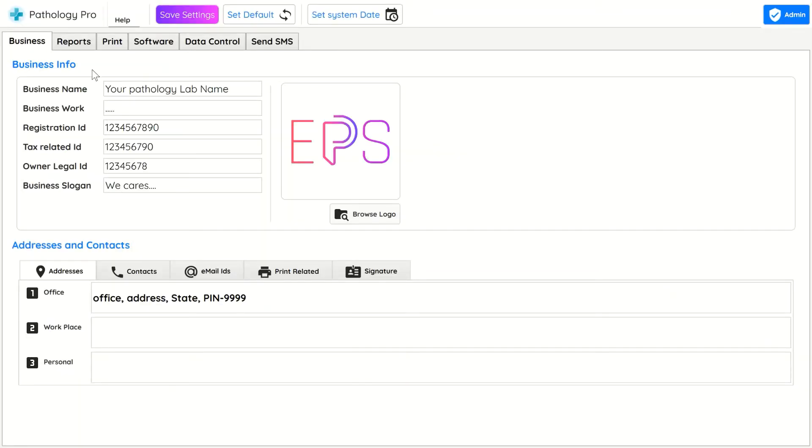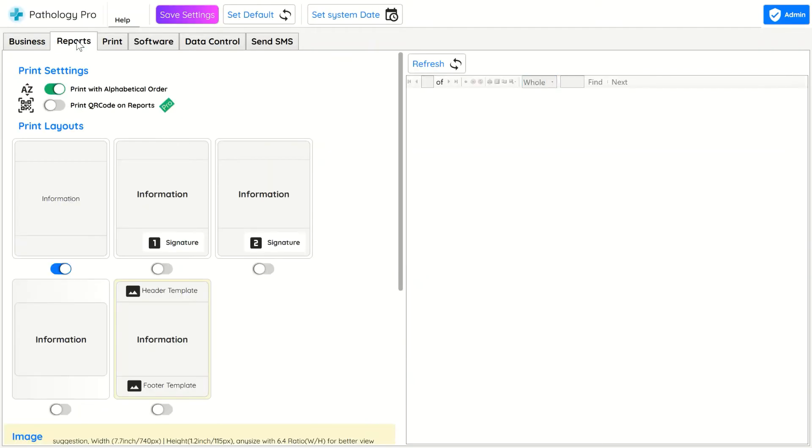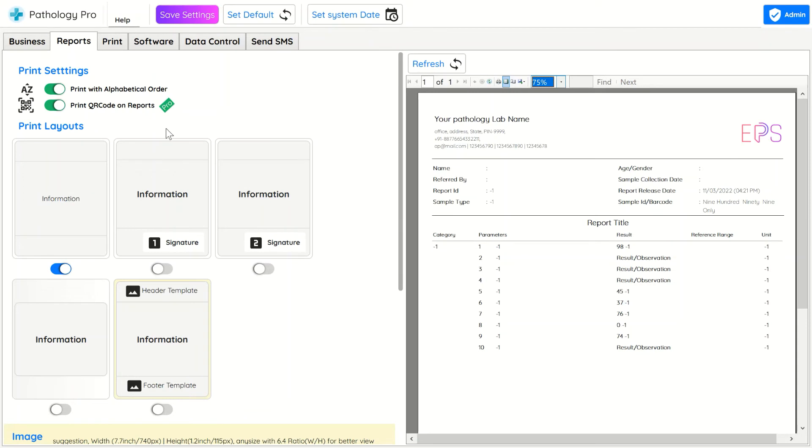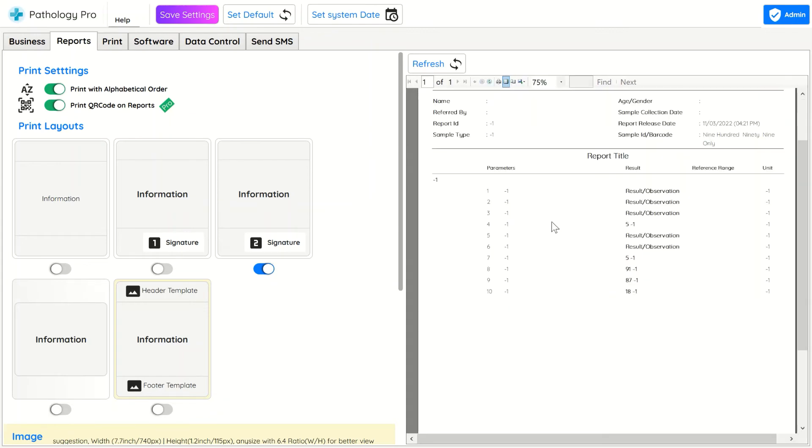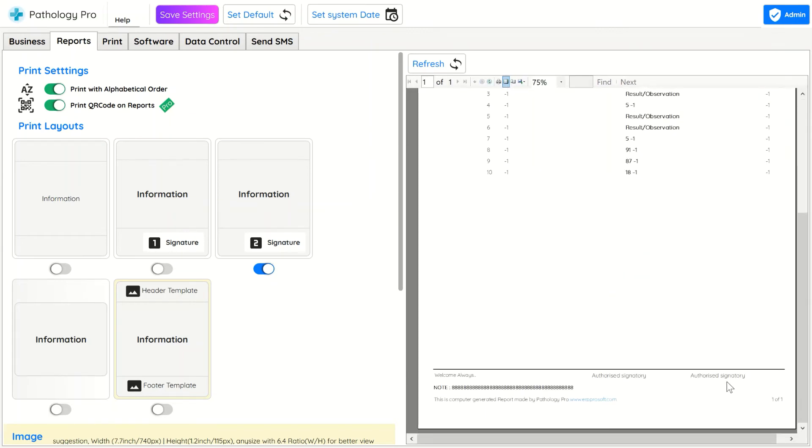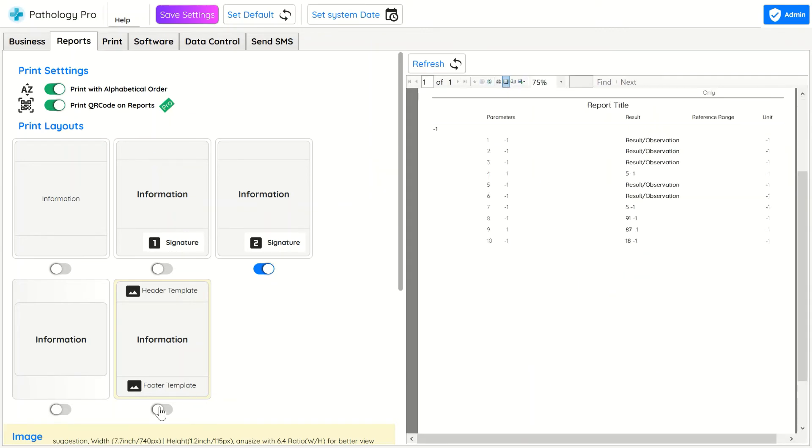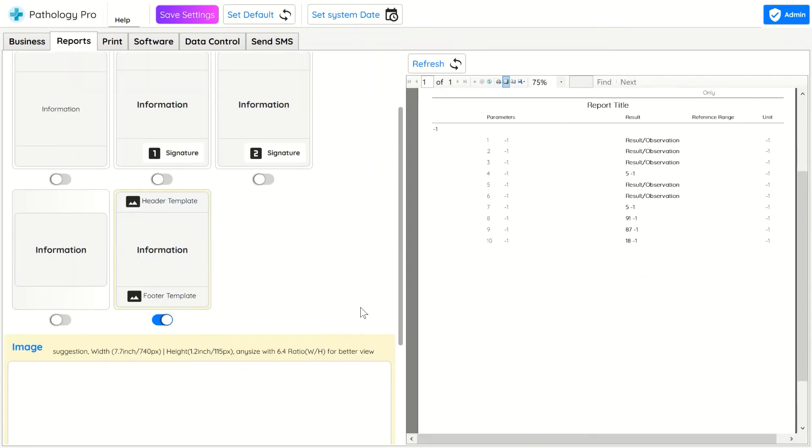In Settings you can change your contact number, report related info, doctor signature name. In Report tab there are multiple report formats. In Last Report format you can upload your own header and footer of your lab.